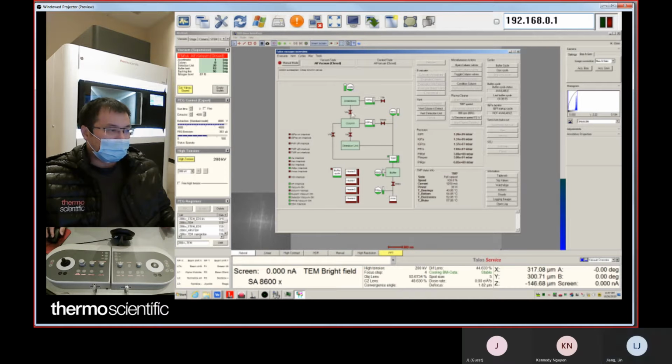accelerator. You see everything is running. This is the ion getter pump, and you see it's running perfectly. You see the pressure there. And this is your turbo pump. You see speed 100%. It's running perfectly. So everything is good. You can see the different pressures for the different pumps here.